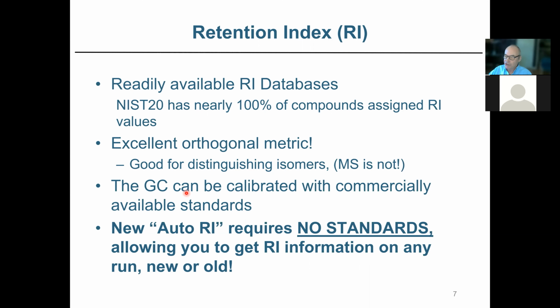We'll talk about how it works. It's interesting, and it's really powerful, and it doesn't work in 100% of all cases. But as long as you have a reasonable number of identifiable compounds in your run, it works extremely well, a lot of times as good and sometimes better than using a standard like N-alkane calibration.